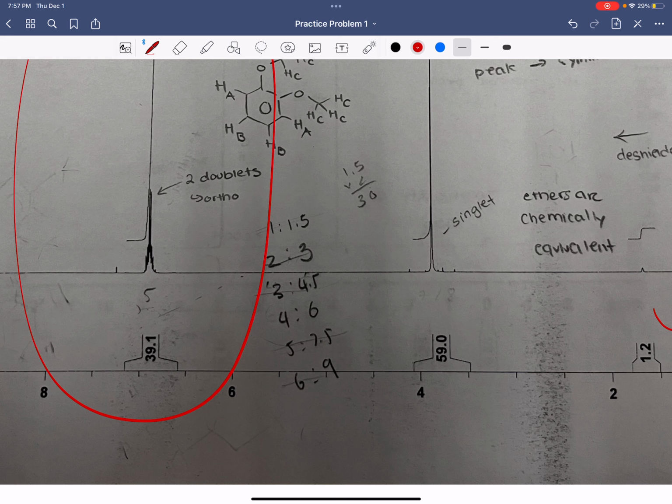However, the possibility of having 2 hydrogens with 4 empty positions for side chains that have a total of only 3 hydrogens is very low.